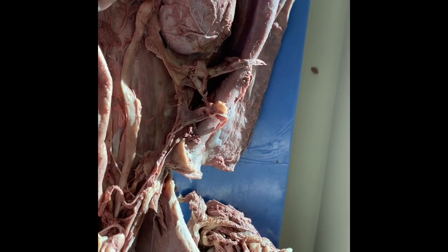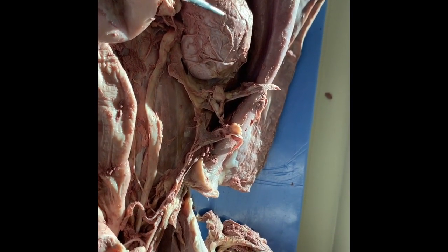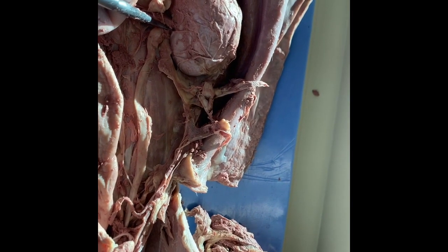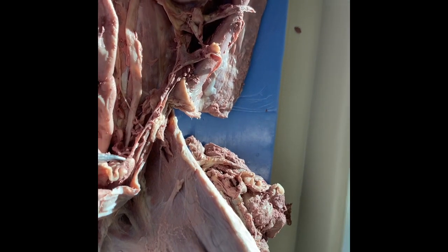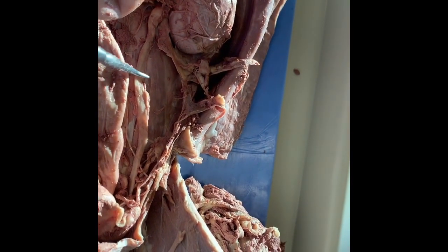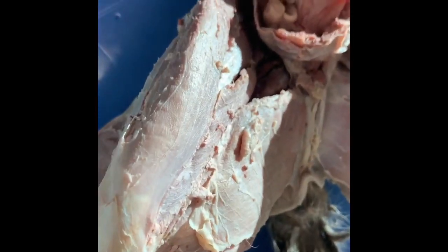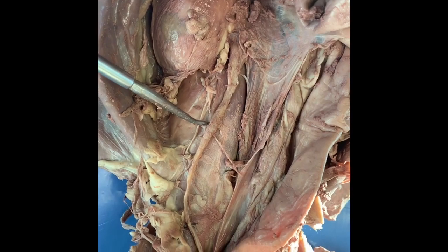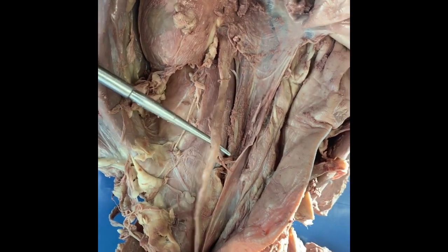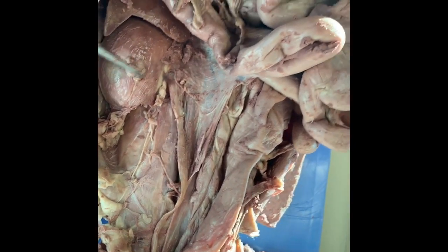So the kidneys filter out the body's fluids, they separate all the important nutrients and the salts, and then that filtrate travels down this ureter and then collects in the bladder. So this is the left kidney, the left ureter, and then on this side, we have the right kidney and the right ureter. So I was able, one of them was kind of hidden on me, okay? So we'll be taking these out shortly.